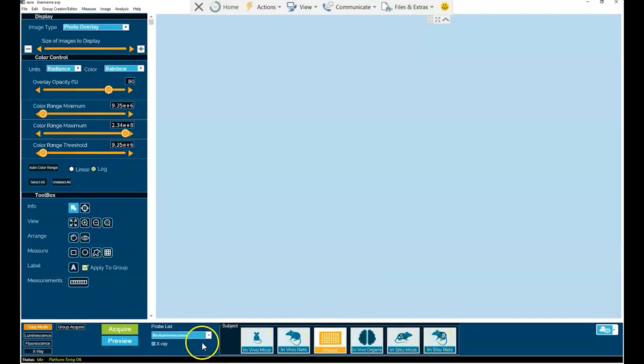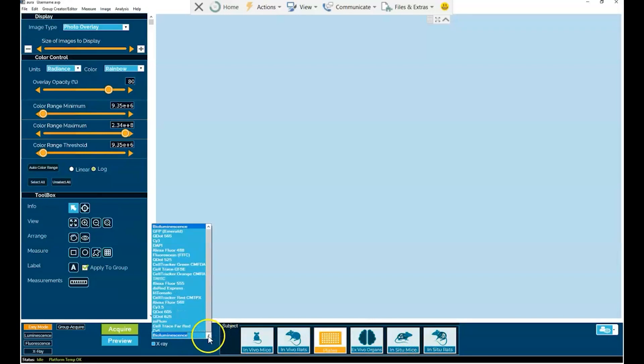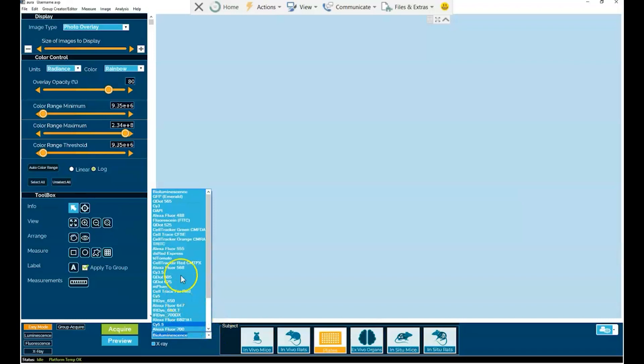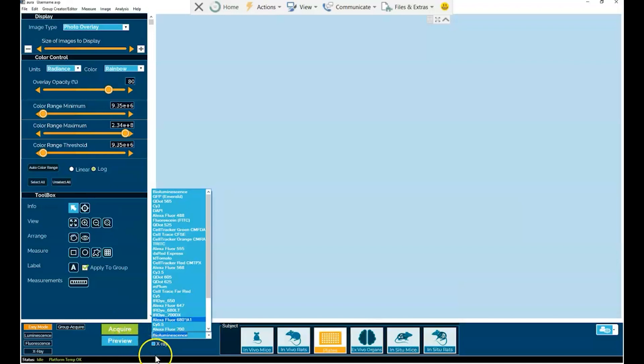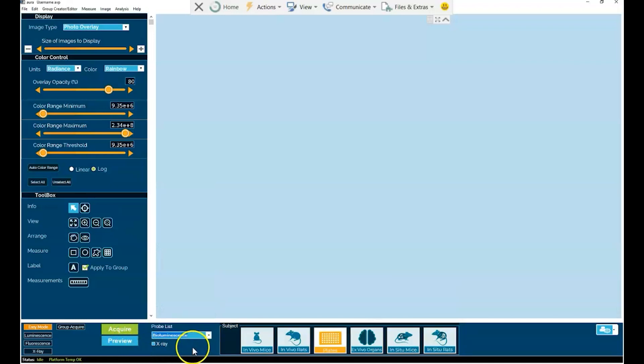Secondly is your selection of probe, your reporter type, be it bioluminescence or any one of the numerous fluorophores listed here. And finally, you simply click on the Acquire button, and you will begin the imaging process.